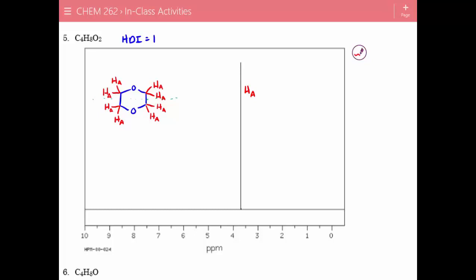All right, so that one was a little tricky. Sometimes you have to go through a process of guess and checking. I know a lot of you were trying to do 4-membered rings with alcohols coming off, but if you do any of those, you would be getting more than one peak occurring in the NMR, and in this case, we only have one.